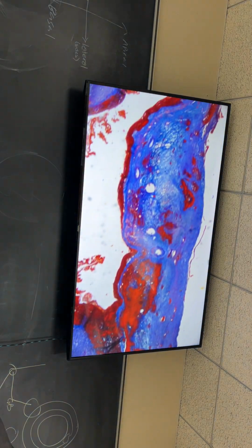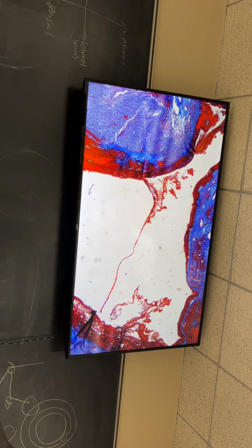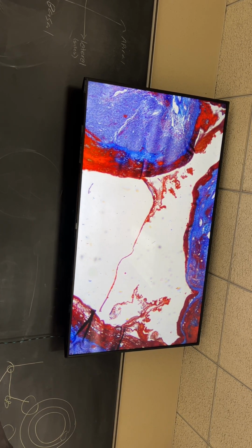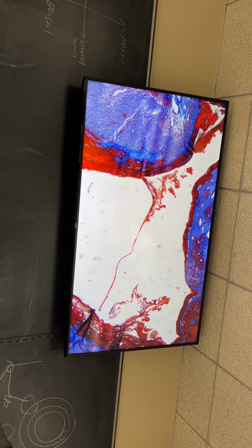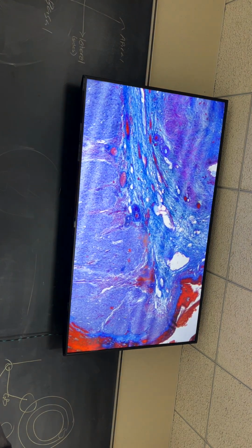Doesn't look anything like what you saw before, right? Well, yeah, interesting. This is, first off, a different stain, obviously a trichrome stain. It's an odd trichrome stain at that. Plus, it's at a very specific time.